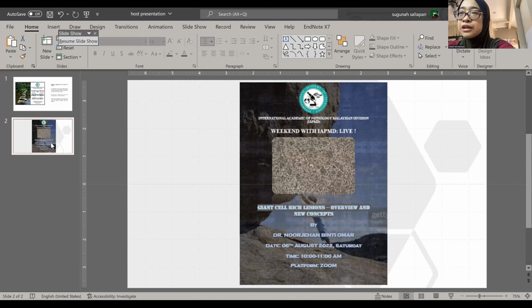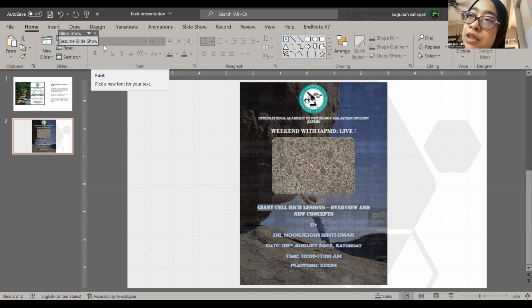I believe a little bit more so than your routine surgical pathology, because you can often get away with less than perfect stains and sections that are a bit thick. But in renal pathology, you probably wouldn't want to play around so much with that and risk assessing thicker sections, and so on and so forth. So if you have any comments on that.